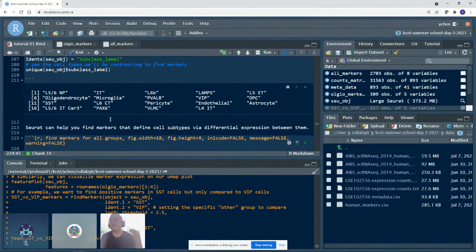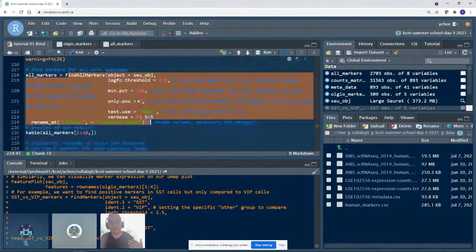What we have done here is taken single-cell RNA-seq data. We normalized our data. We did a simulation of finding clusters of cells, and we saw that they generally match very well with the subclasses defined by the Allen Institute. We took the subclasses from the Allen Institute, and we did statistical testing for every gene, or at least every gene that passed our thresholds, comparing between every cell group and all the other cells, resulting in a list of genes that are highly and relatively specifically expressed in each cell subclass relative to all the other cell subclasses. So this is the end of the first tutorial.